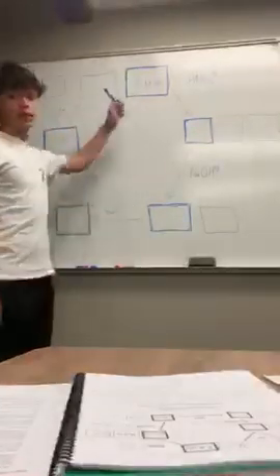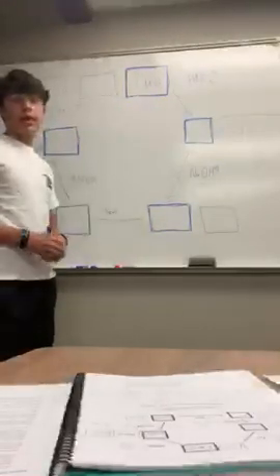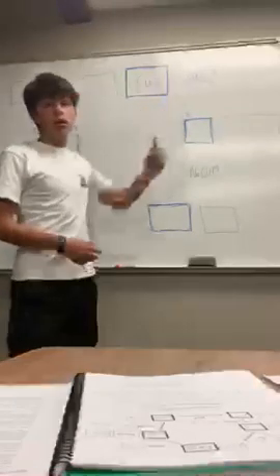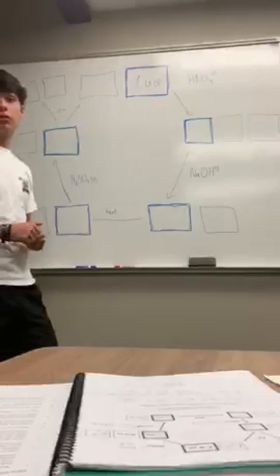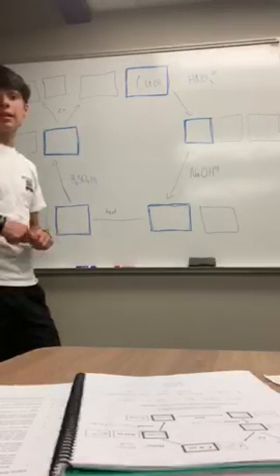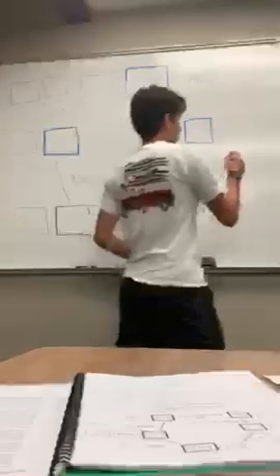So first, this experiment started with copper turnings. Then, nitric acid, which was a liquid, was added to the copper turnings. The copper turned green and dissolved in the solution. Brown fumes were released into the fume hood, and those brown fumes were nitrogen dioxide gas.